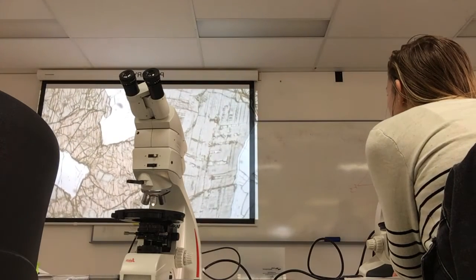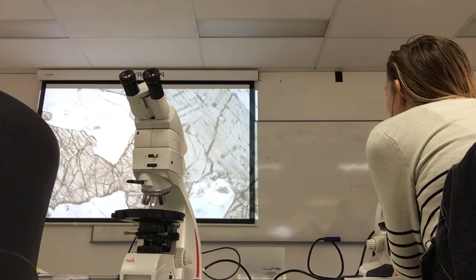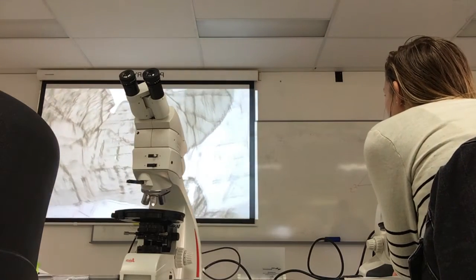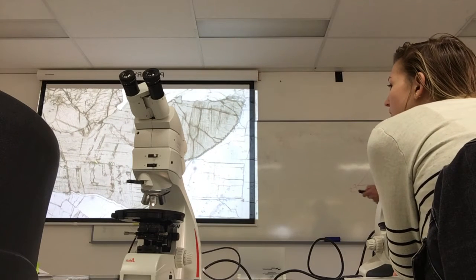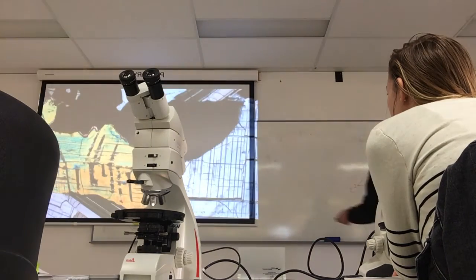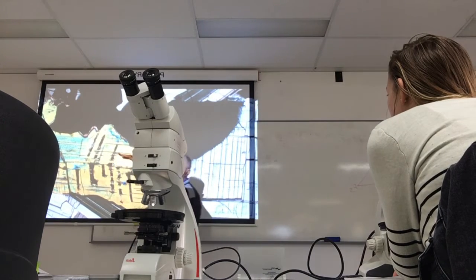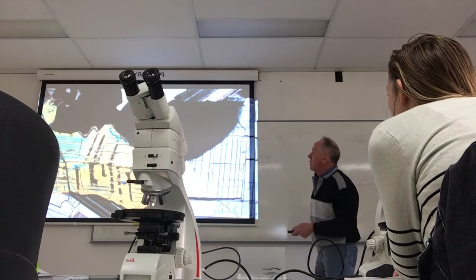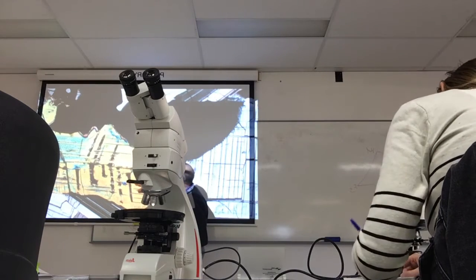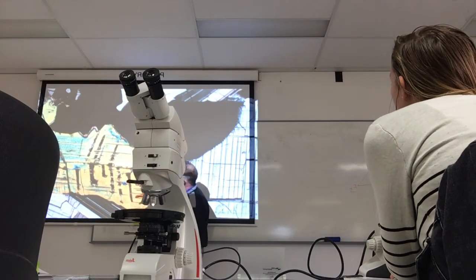These are relatively iron rich. Okay, almost looks like an orange there, doesn't it? But notice that this here is changing as well. The stuff inside here, and so these things will exsolve along planes of weakness. So that will be close to one of the cleavage orientations in the pyroxene. You've actually got two separate stages of exsolution in here. All this fine stuff running this way, they're all exsolution lamellae as well. So this has undergone probably two stages of exsolution. The second one, you can actually see overprints the first one. You can see an overprinting relationship there. We don't need to get this fancy with your description, but I thought I'd point it out. So that's happened at a lower temperature, and accordingly it's finer.